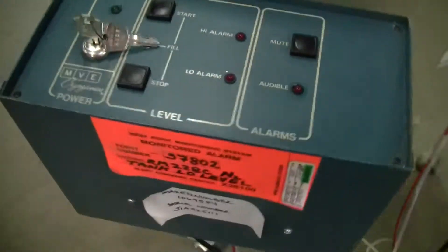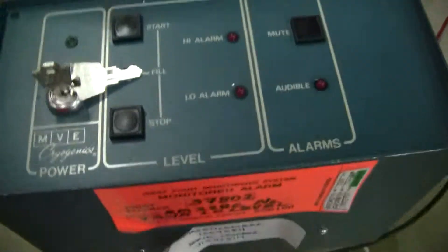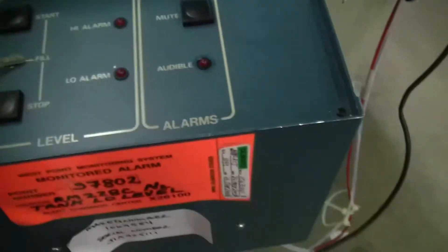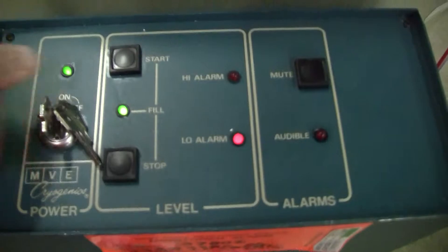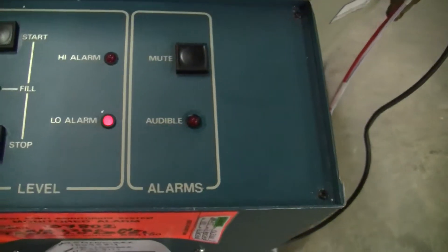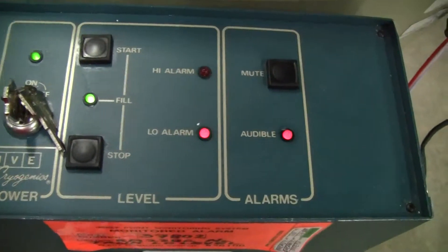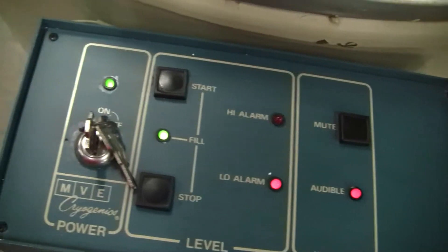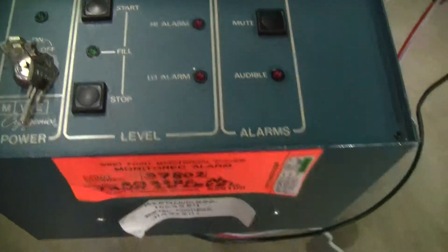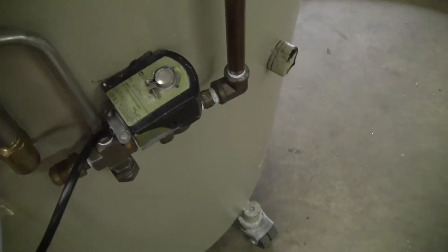Let's take a look at the alarm. Maybe I should plug it in. I should turn it off. The alarm is on mute at the moment. There's the alarm. You can hear the solenoid going on and off.